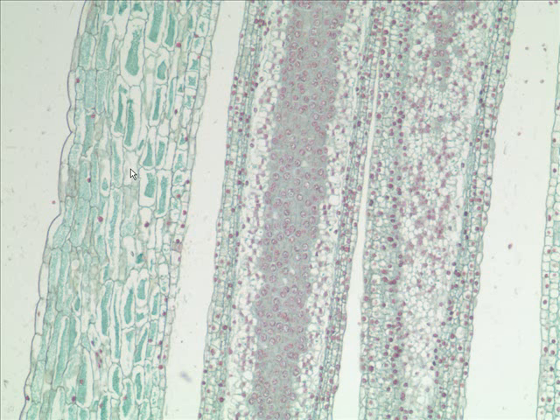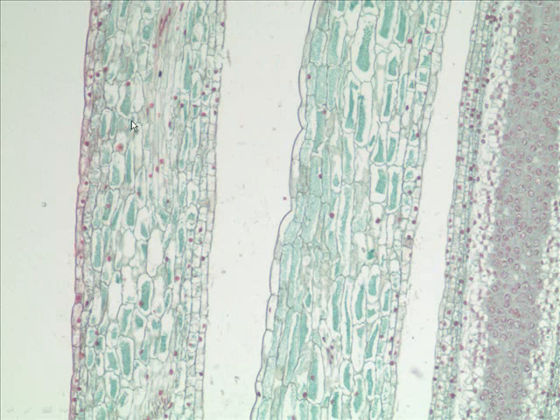And next, outside the anthers, there is what? What's the next thing outside? We're working our way out. It must be a petal. And finally, last picture for this specimen, we see to the right, we see an anther, part of an anther. And outside the anther is what? The petal. And finally on the left here would be the very outside of a closed up baby flower, a sepal. That is absolutely correct.